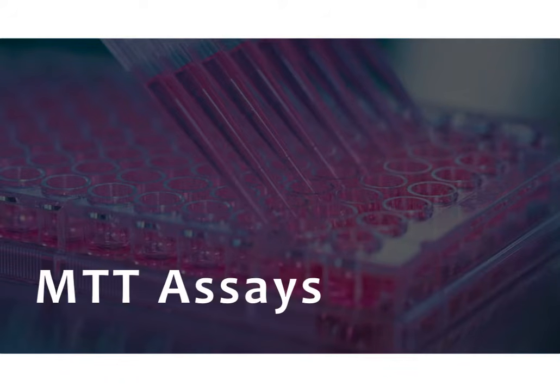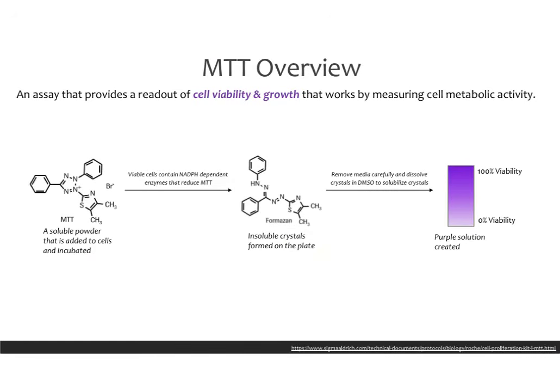In this video, we're going to talk about MTT assays. These assays are very simple assays that are designed to allow you to see viability and proliferation of cells. So let's start with a simple overview of how this assay works.